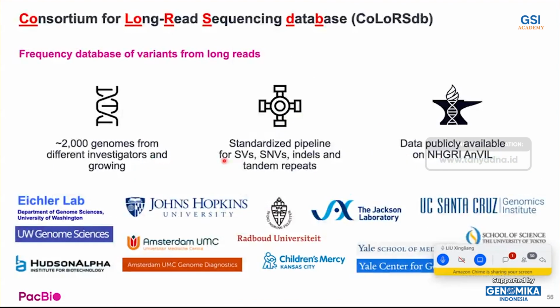So that's why we are leading the efforts to build a comparable population-based variant database, mainly derived from long-read sequencing technology. That will give you better annotation and interpretation when you're dealing with variants derived from long-read sequencing technology like PacBio HiFi sequencing, right?